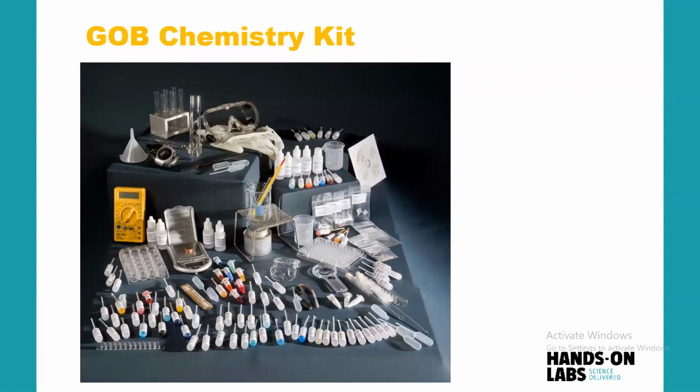Again, the kit that we'll be offering for this course comes with both durable materials as well as consumable materials. The durable materials are things like glassware and thermometers, things they can use in different experiments over and over again. And the consumable materials will typically be the chem bag. For each experiment, there may be a chemical they need in a small dropper pipette that they will use for that one experiment. They'll use it up and then dispose of it at the end of the experiment.